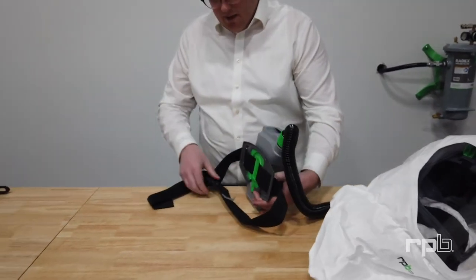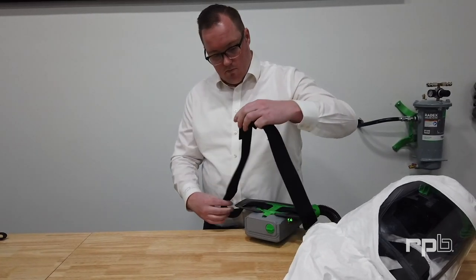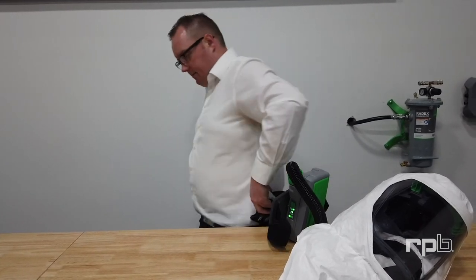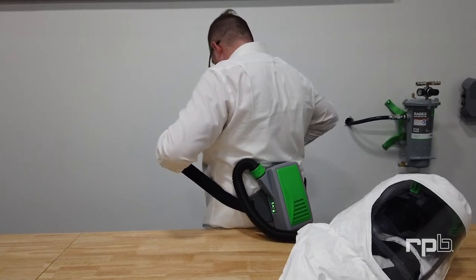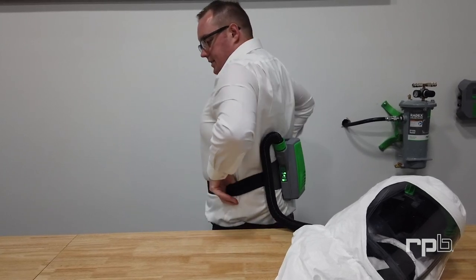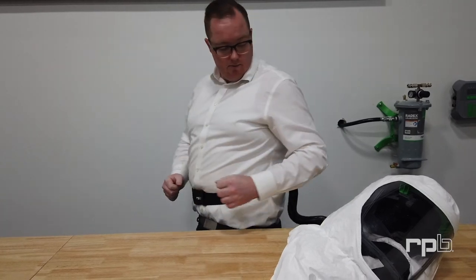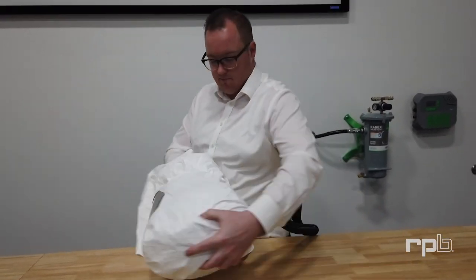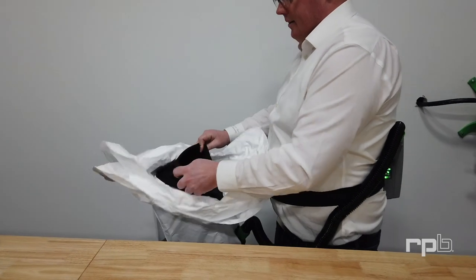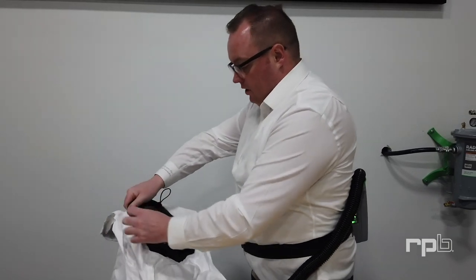You can then get the PX5, undo the belt, and attach it around your waist. Do the belt up so that it's snug and doesn't allow the PAPR to slip down. Once that's in position, you can then get your T-Link and hold the black collar on the inside, letting the outer collars drape over the T-Link.